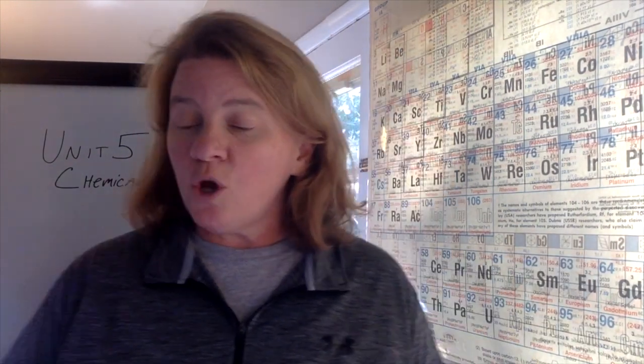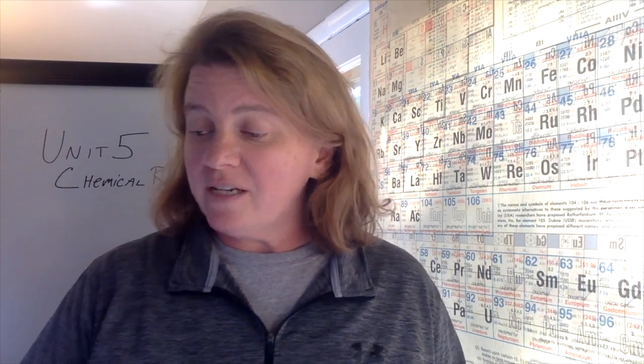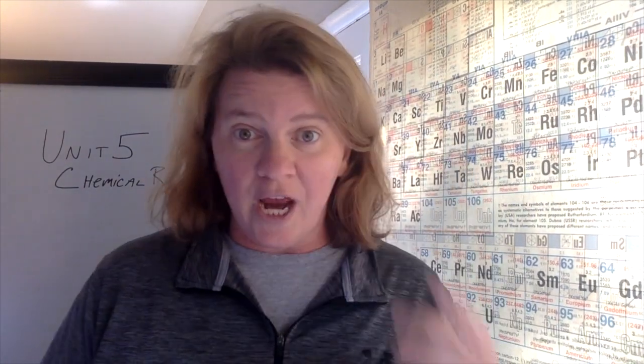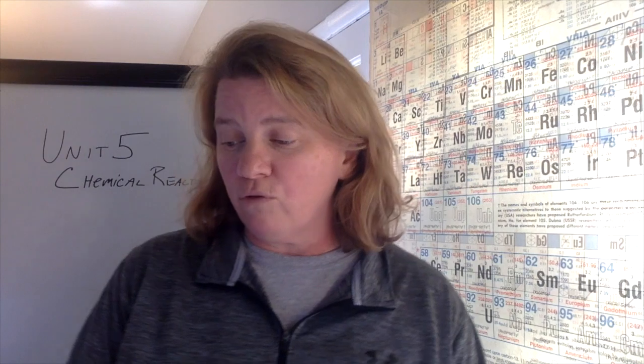All right, so some evidence that you know that there's a chemical change, how you're going to know that it's going to happen. We've listed that on top of your lab. Again, this is the lab that you're doing. All right, so things to look for. Look for a color change. If a color changes, that can be certainly a sign of a chemical reaction.